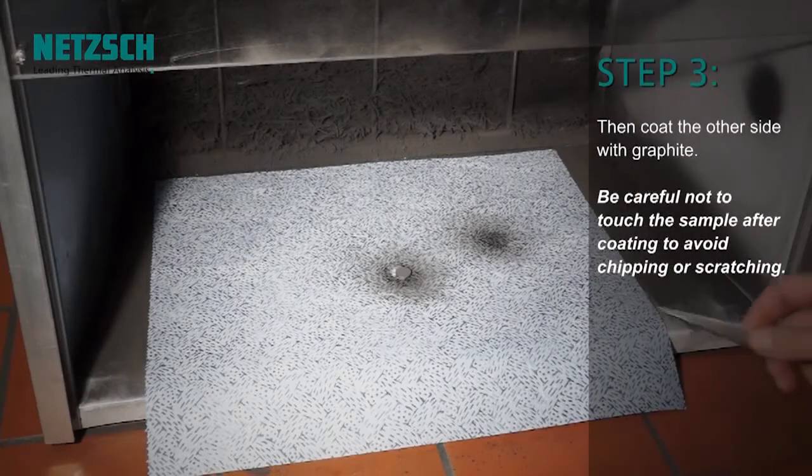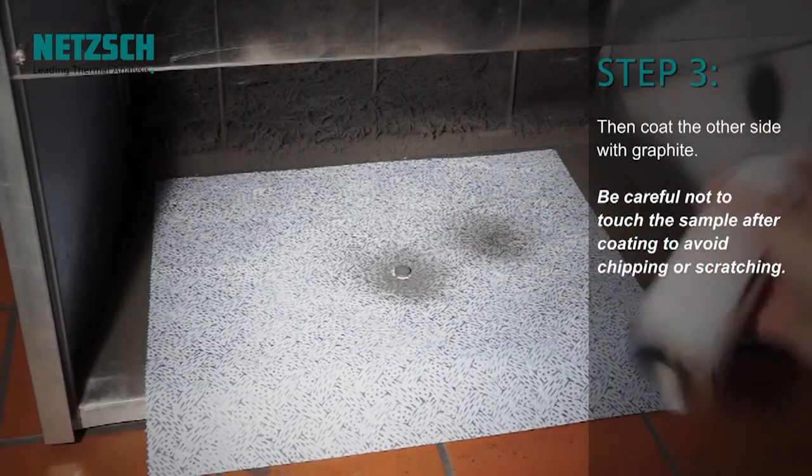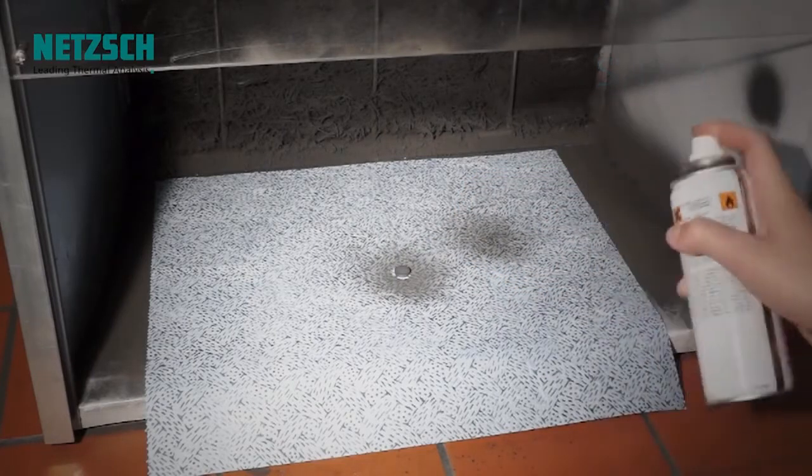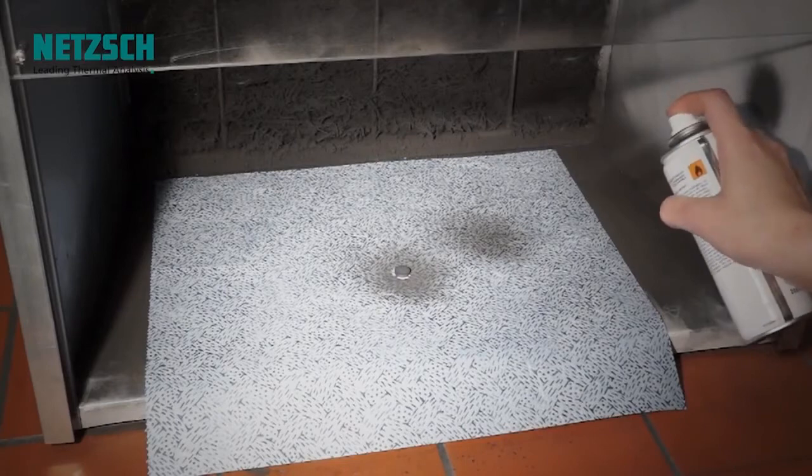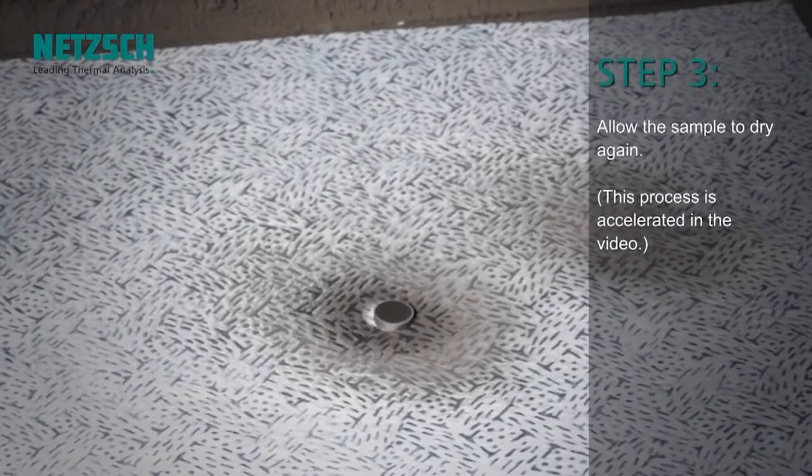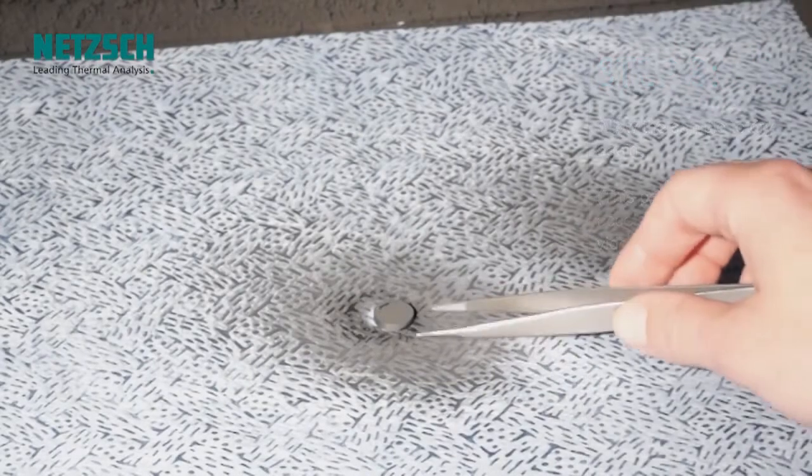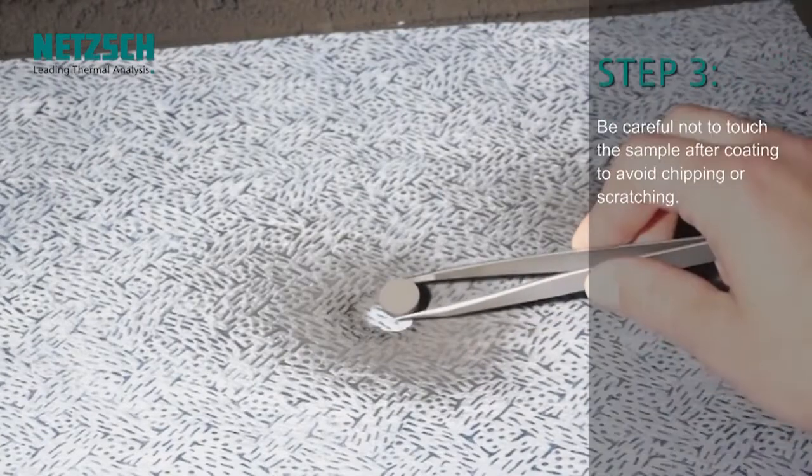Then coat the other side with graphite. Allow the sample to dry again. Be careful not to touch the sample after coating to avoid chipping or scratching.